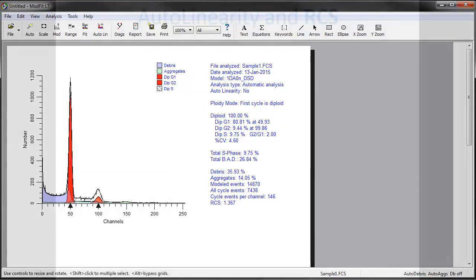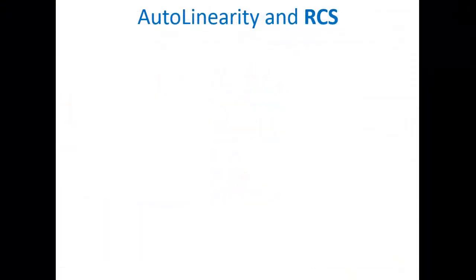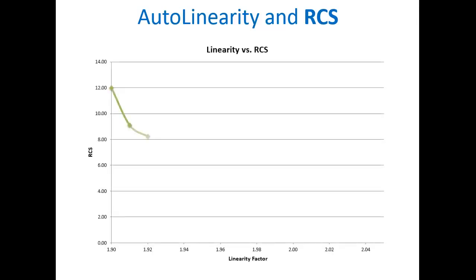How does autolinearity determine the best fit? It does a series of analyses from a low value to a high value and keeps track of the resulting RCS values. The lowest RCS value represents the best fit of the data. It then does the final analysis with the best linearity value.